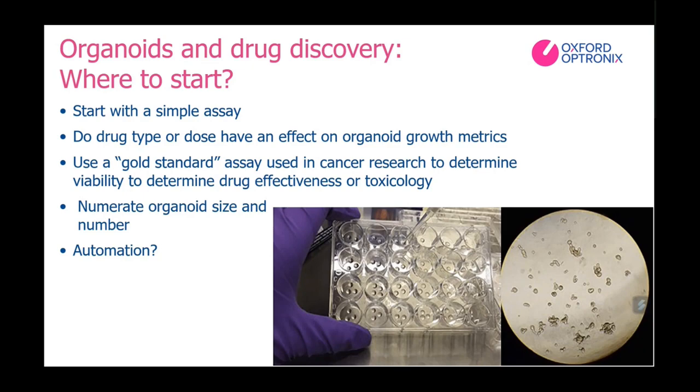And very simply, what they're doing is they're taking their organoids, they're treating them with different drug types or doses in assays comparable to clonogenic or tumor-forming assays, where either colonies, or in this case, organoids, will grow or not. Then, after some period of time, these researchers will enumerate the number of organoids they have and compare growth or size metrics across treatments to assess treatment effectiveness.